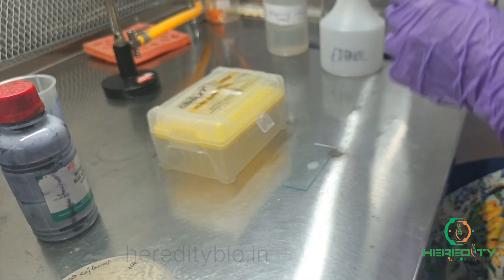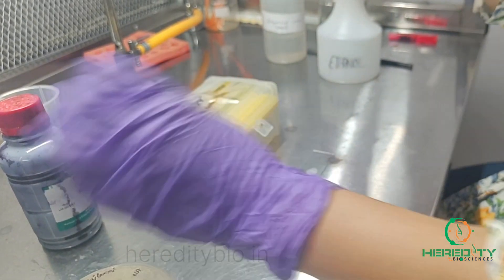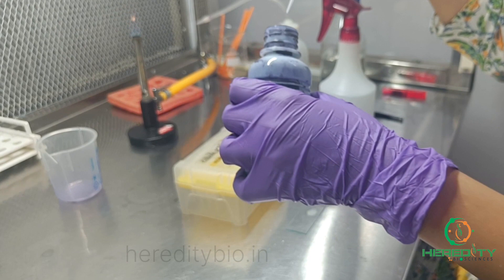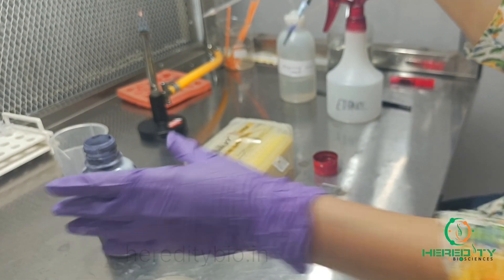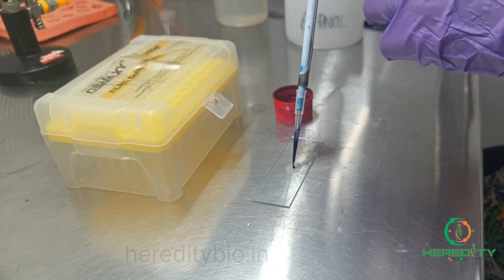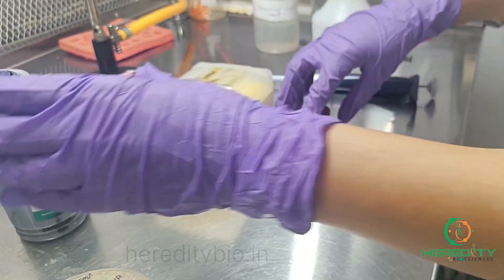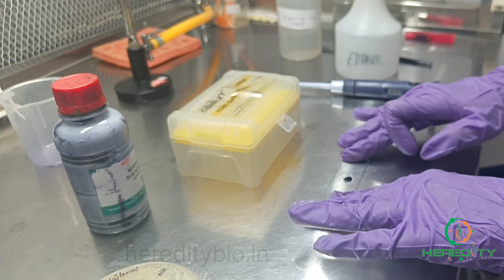Then we'll use methylene blue as a simple stain. We'll take one or two drops of methylene blue and place it on the heat-fixed smear. We'll allow it to stand for a minute.